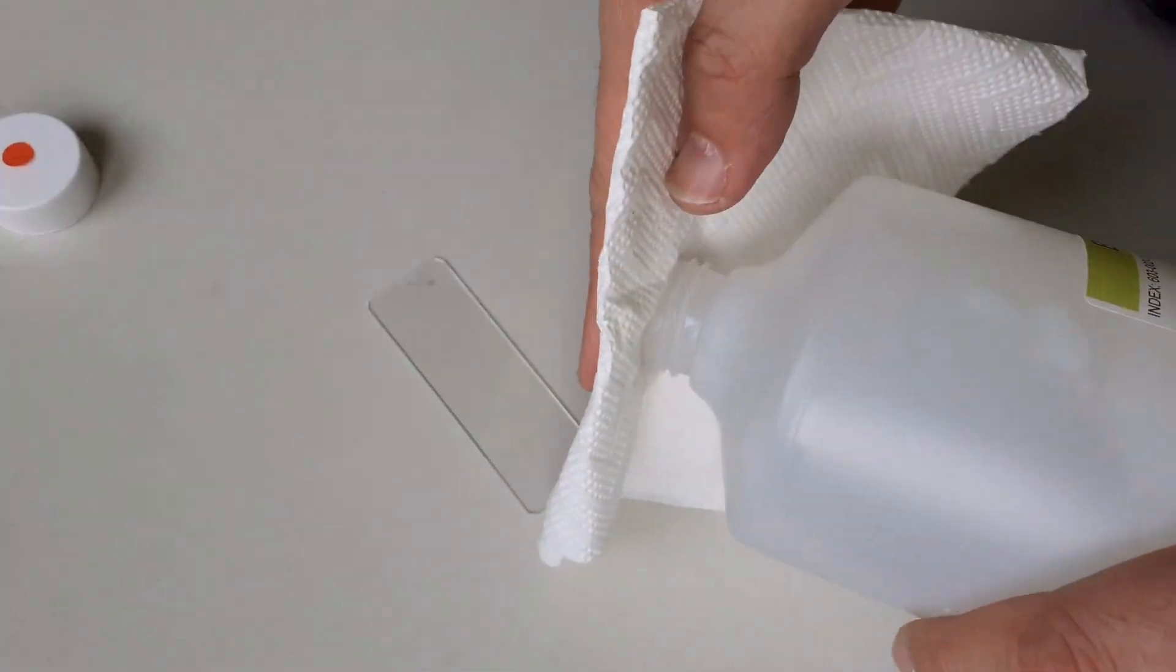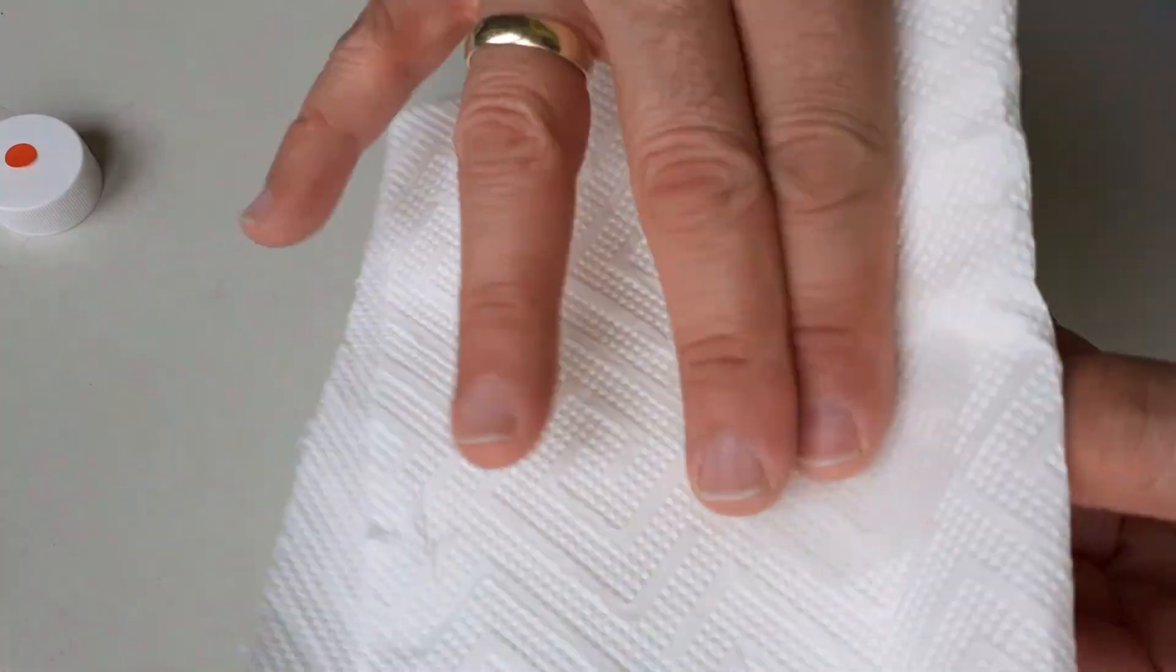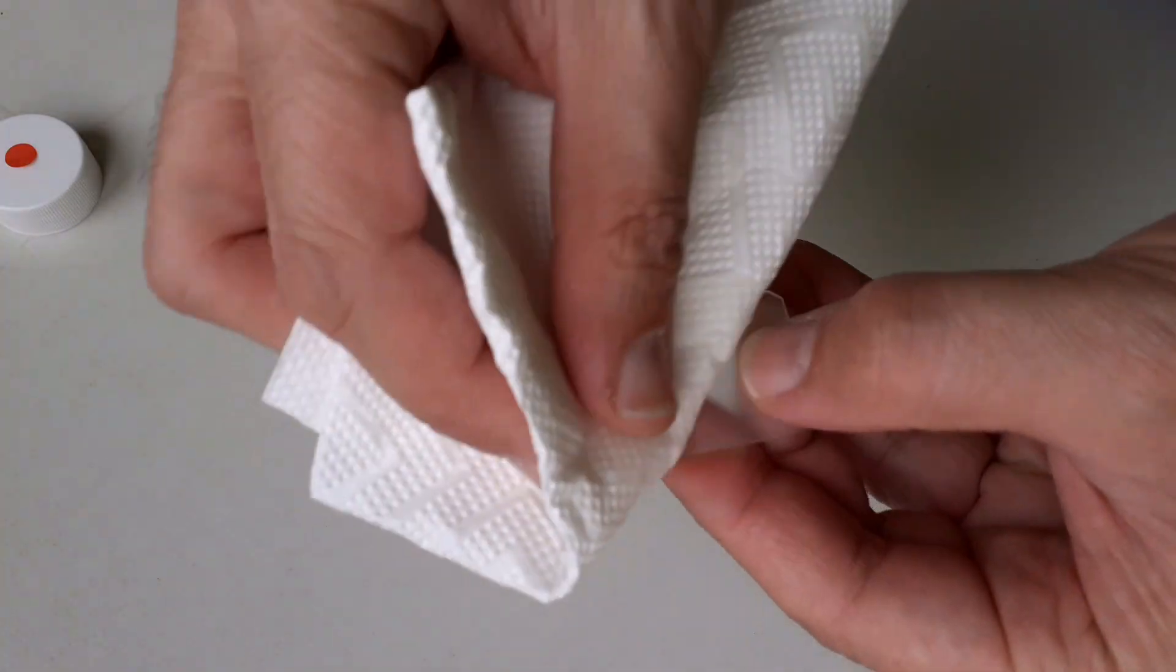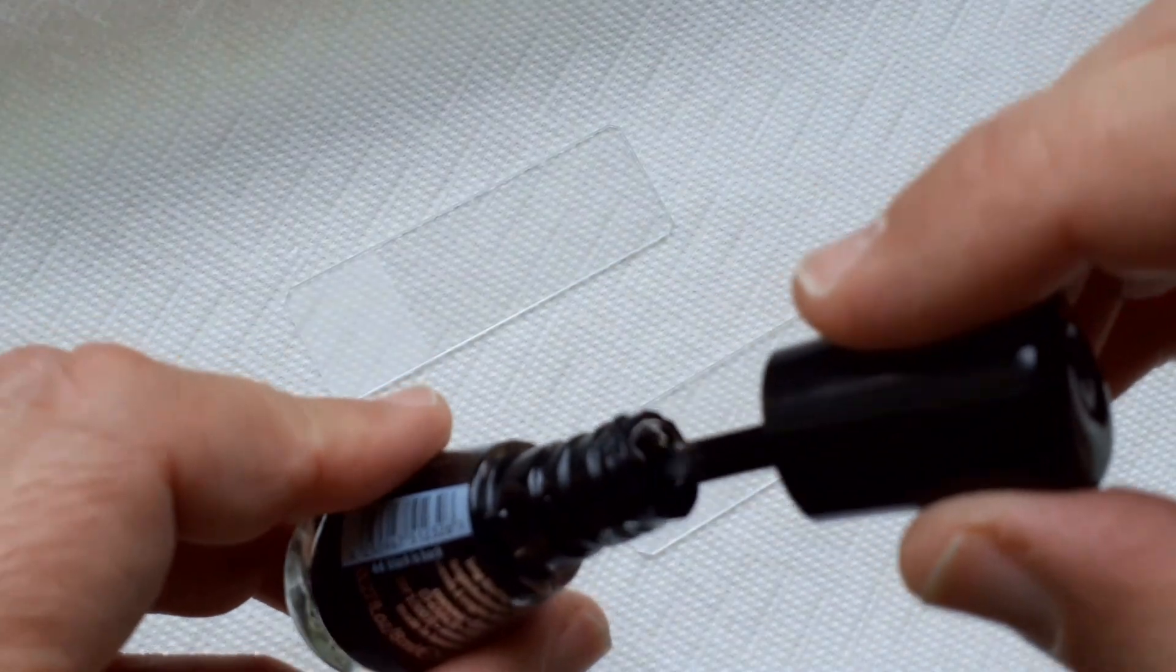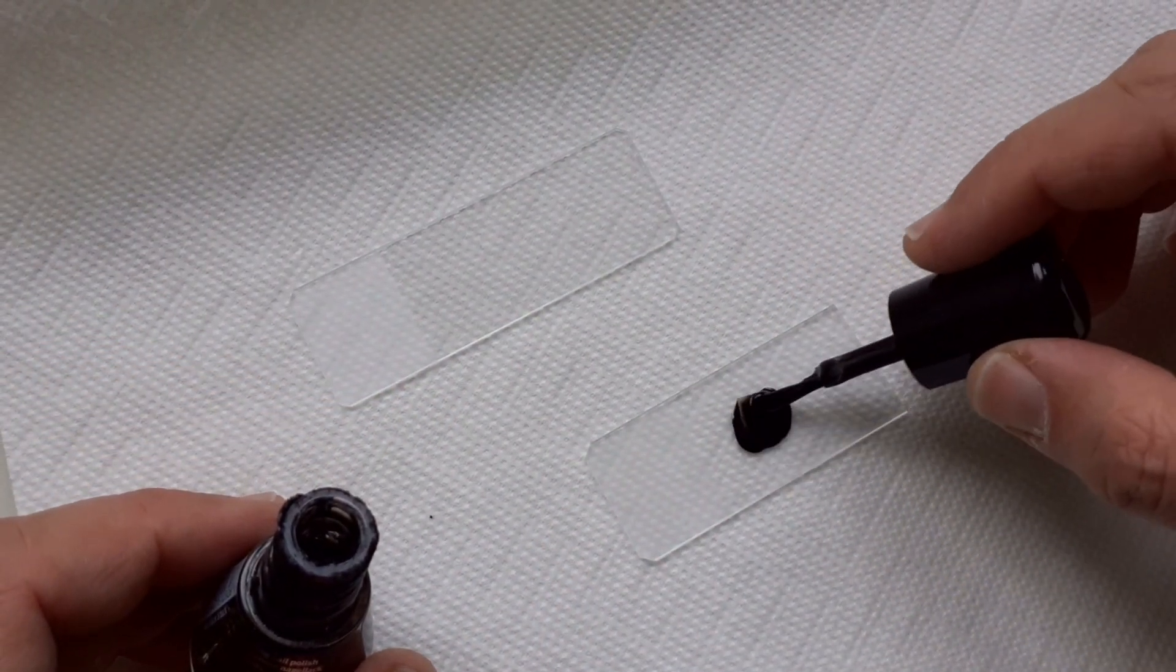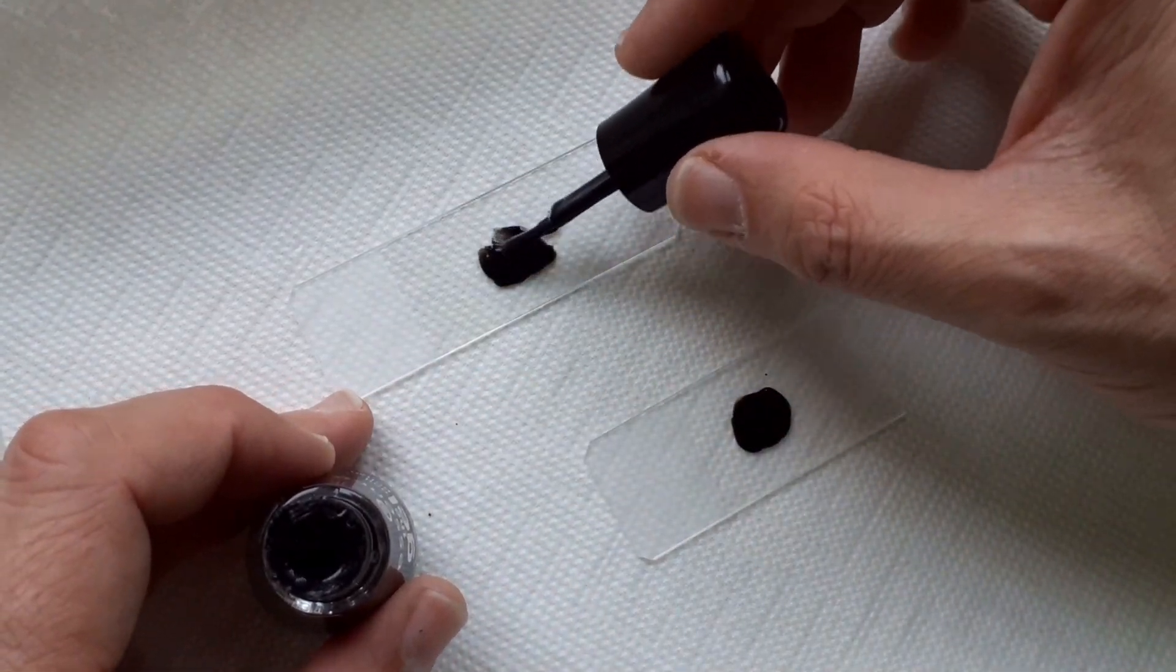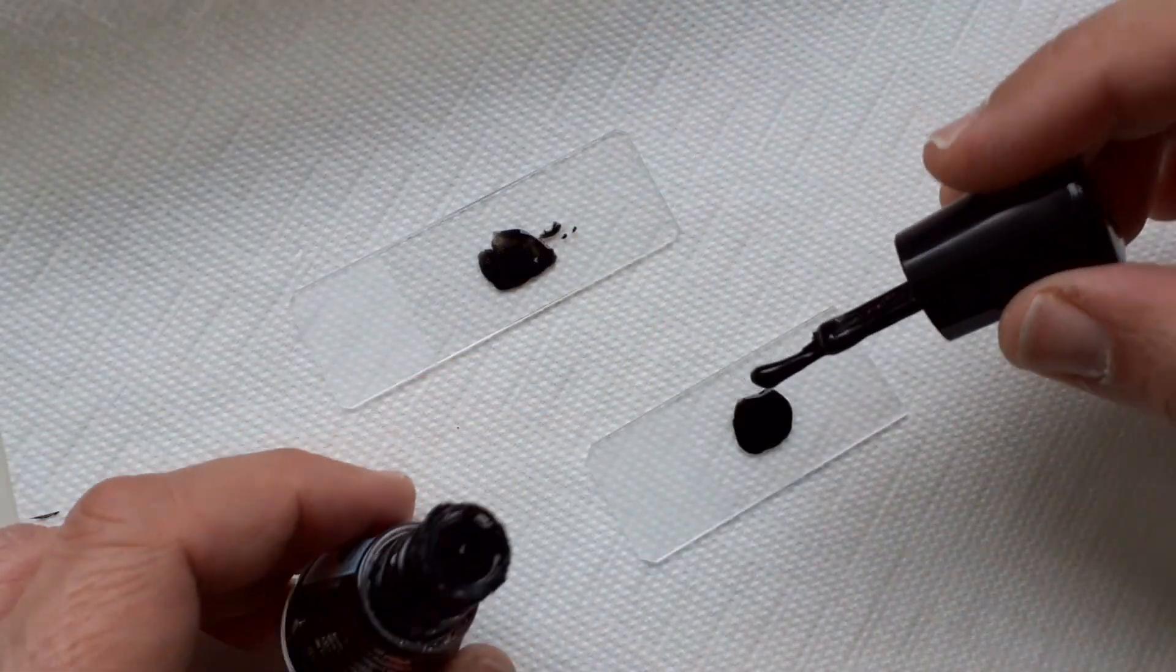I've used first some alcohol to remove any grease and fat from the surface of the slide, and I hope that this way the nail polish is going to stick better. I'm using black nail polish simply so that I can see it better. That's now the slide that I treated with the sandpaper, and the top slide is completely smooth.